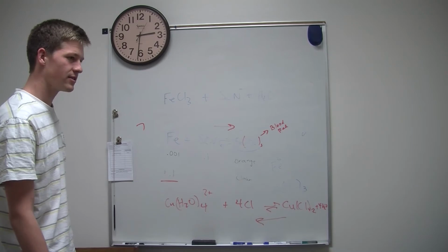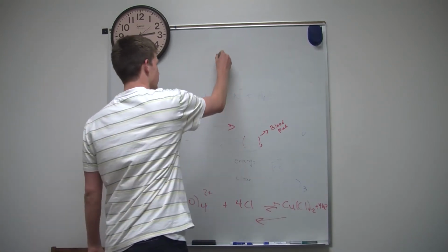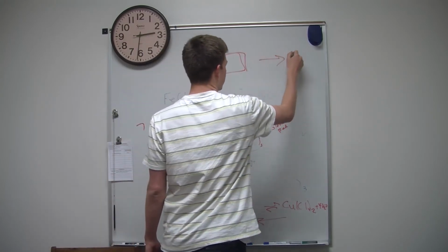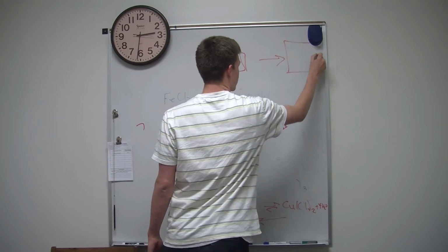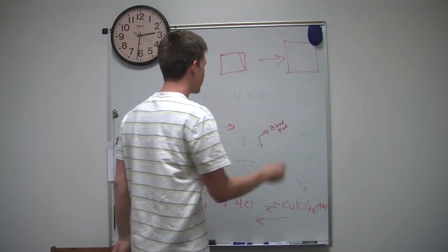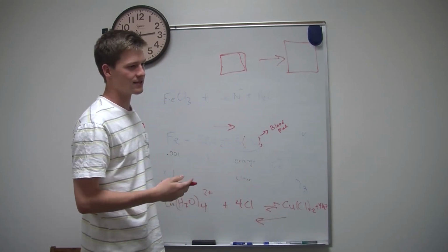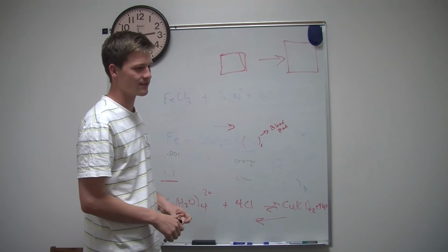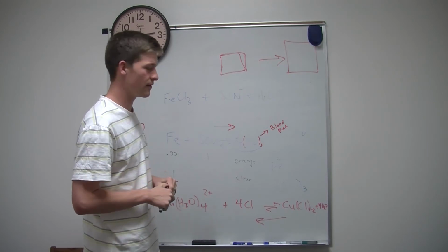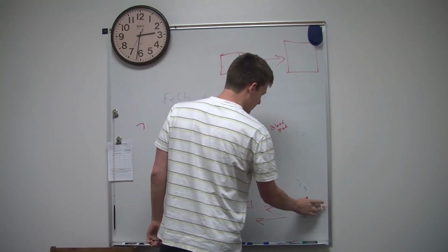So what you're thinking of with the space is like if we run an experiment in here, and then let it happen in here, because we do the experiment in this bigger one. But then you're dealing with gases as well and stuff like that. So typically, Le Chatelier's principle, your idea is right. If this would have been just this over here, let's say we didn't have the water.